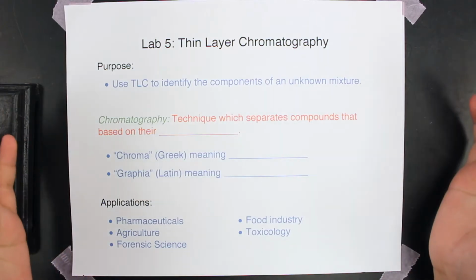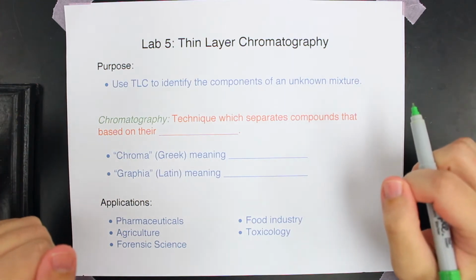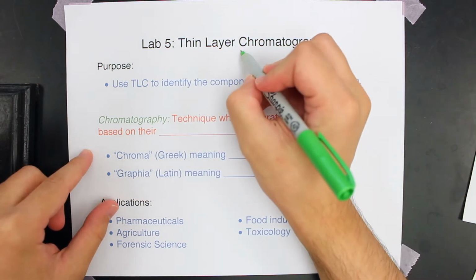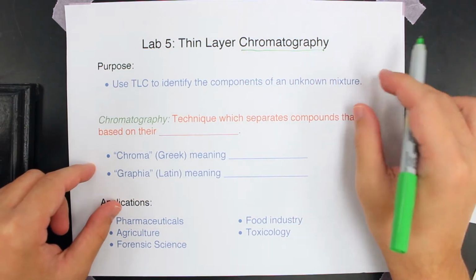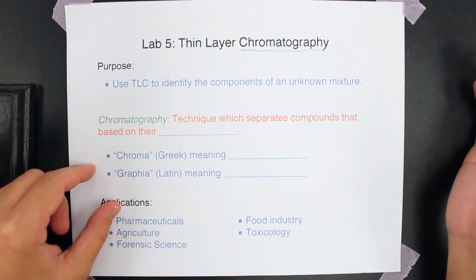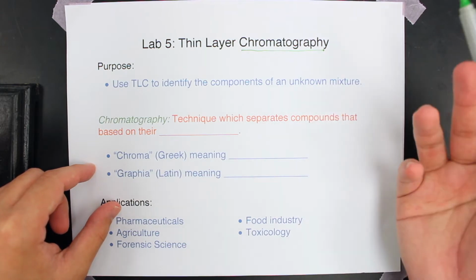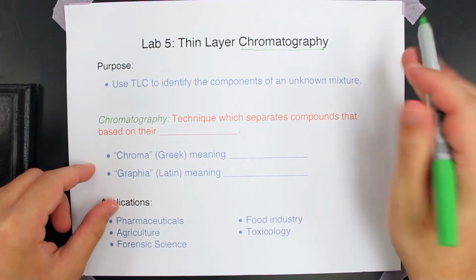Alright, hello everyone and welcome to Lab 5 of our Organic Chemistry series that is online this semester, and this week we're going to be going over thin layer chromatography. So chromatography is the operative word here. That's the technique we're going to be analyzing, and the purpose of today's experiment is to use this technique to identify the components of an unknown mixture. But before we can fulfill this purpose, we have to go over what chromatography is.